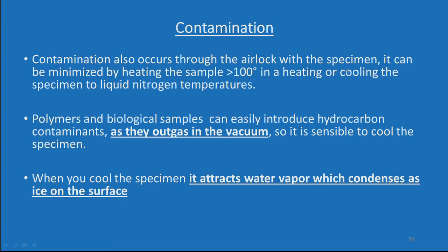Contamination also occurs through the air lock with the specimen. It can be minimized by heating the sample above 100 degrees or by cooling the specimen to liquid nitrogen temperatures. Polymers and biological samples can easily introduce hydrocarbon contaminants as they outgas in the vacuum, so it is sensible to cool the specimen. When you cool the specimen it attracts water vapor which condenses as ice on the surface. These are general guidelines within the column, and we will discuss further aspects when we go to the sample preparation class.